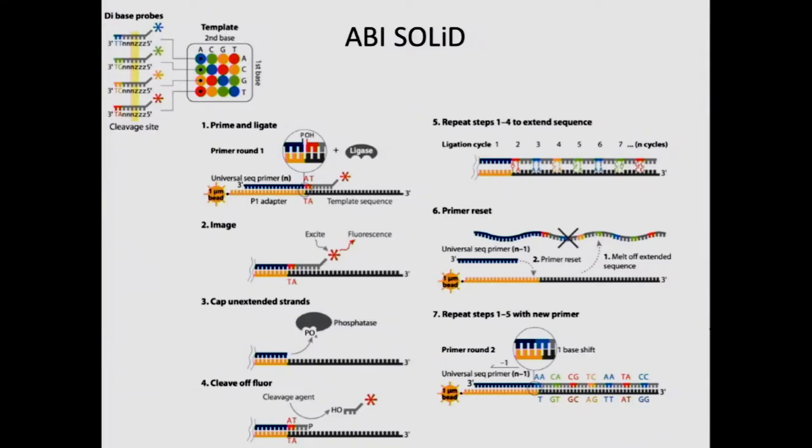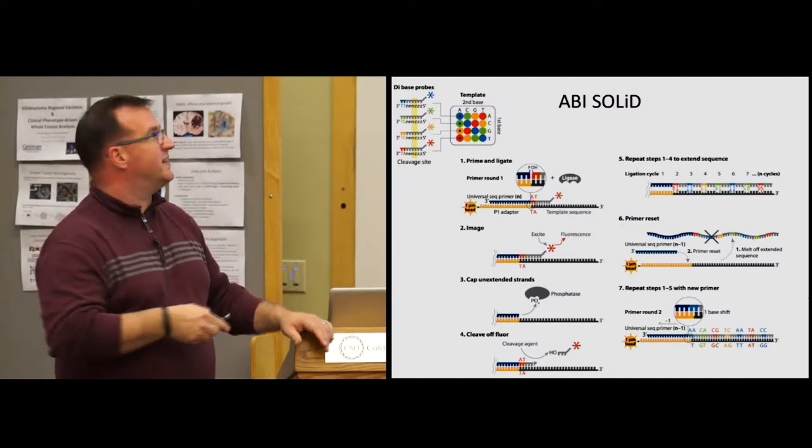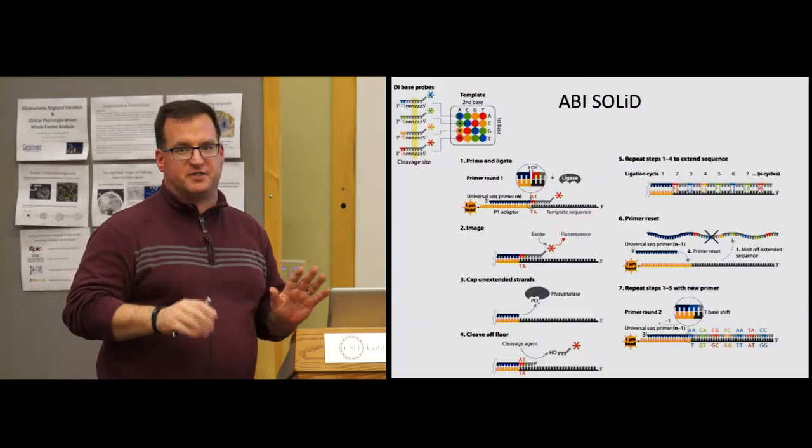And then the following three bases are bases that cannot hybridize. Okay, so that's kind of weird. And then the color of the fluorescent probe is based on this weird table of dinucleotide pairing. So if I have an A and an A, then that's blue. Or if I have T and a T, that's blue. But if I have T and a G, then that's green. But if I have a C and a G, then that's red, etc. So you have four times four, 16 different dinucleotide sequences, but only four different colors, and then this table. Okay, so that's the first thing that's a little bit weird.